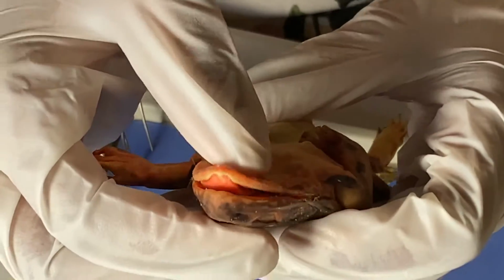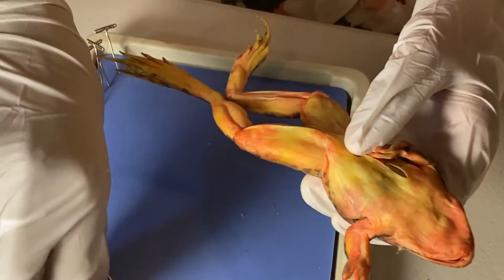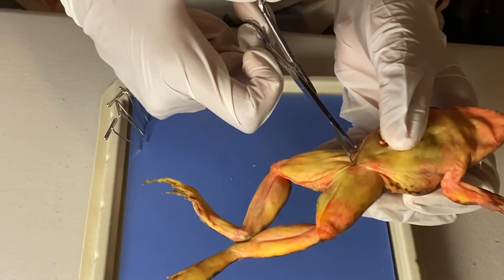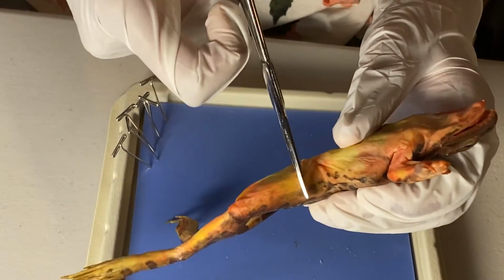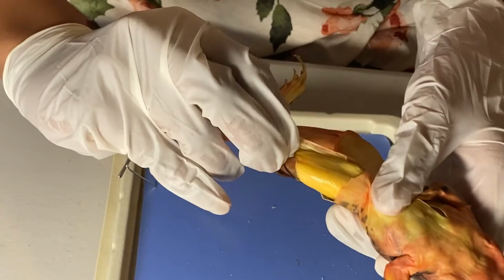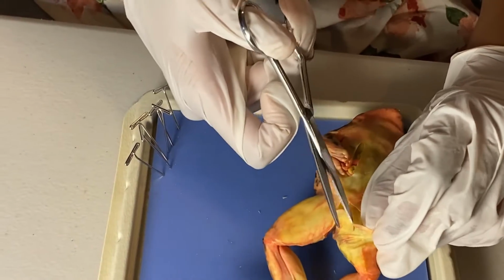Now that we're done with the mouth, let's move on to the legs. So what I'm going to do here is I'm going to cut through the skin and peel it off. And I'm going to expose the muscle of the frog. So just cutting through this.